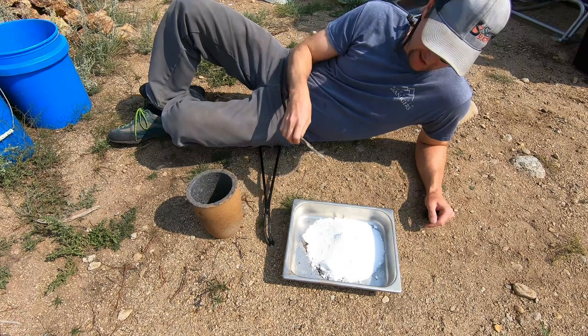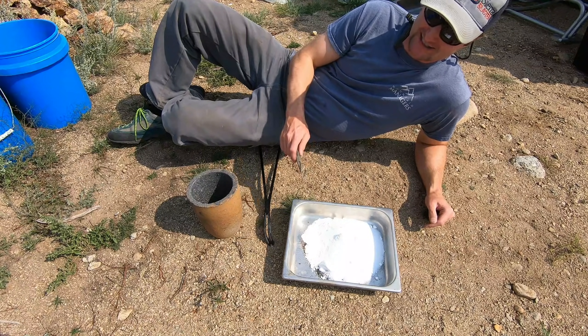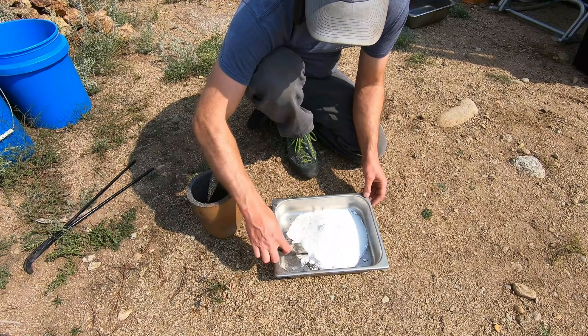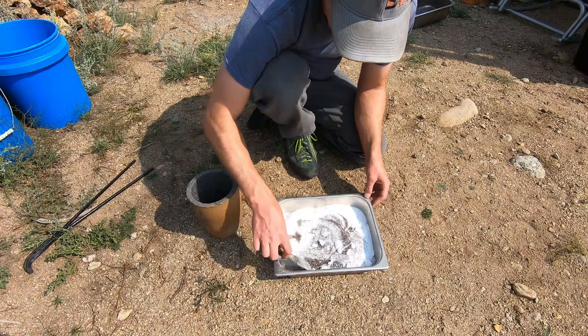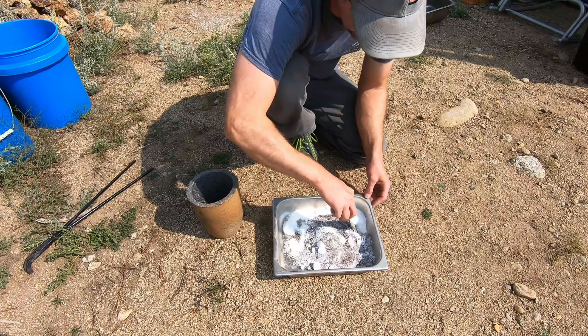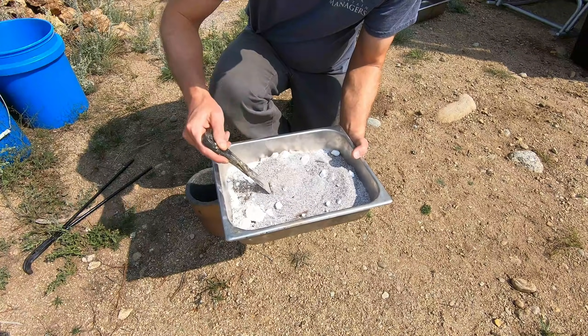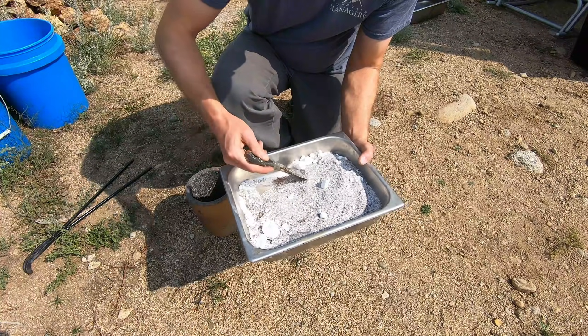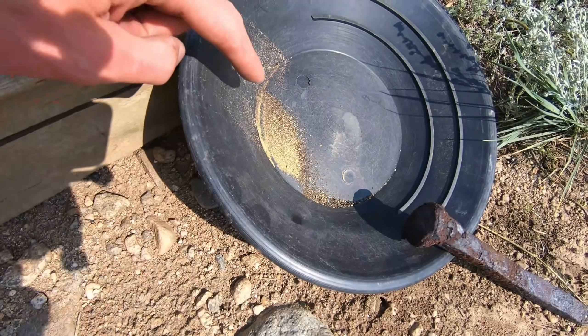Welcome back guys, today is smelting day. We're doing a large 500 gram assay in this large graphite crucible today. We got our cons all mixed up with our fluxes — gotta mix and congeal everything perfectly. Once I get it all homogeneous, we'll add it to the graphite crucible. I'm also gonna add the contents of this pan.